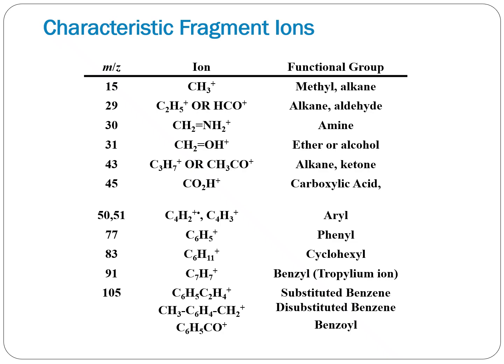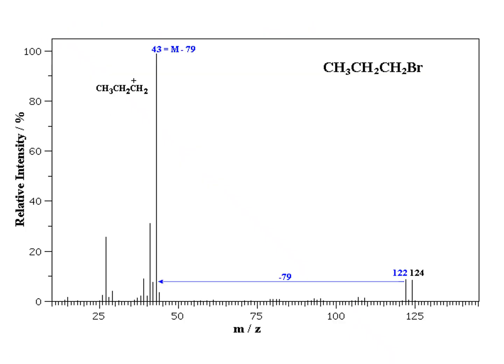Now, the bottom half of this are not structures that we are likely to see in our syllabus, but this is just to give you an idea of what starts to become familiar when you are fragmenting, so that when we start to create our molecular structures, you get an idea of how things will break.